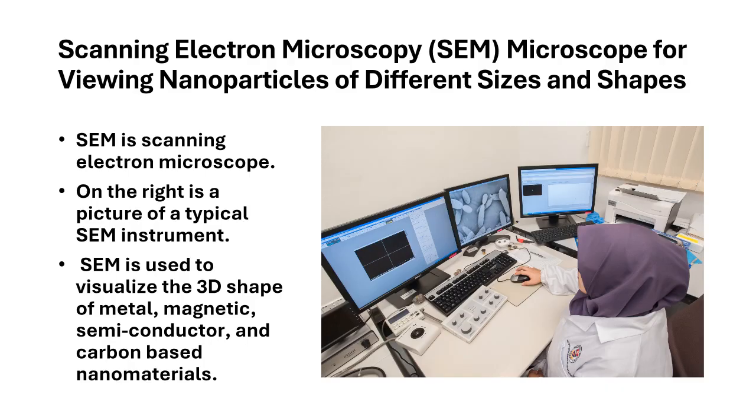Sample preparation for SEM and HRSEM is different than for TEM or HRTEM. For SEM and HRSEM, it is necessary to use a SEM stub and affix a sticky black carbon tape onto the stub. Then the sample needs to be placed on the sticky top side of the black carbon tape. Once that is done, the sample is ready for SEM or HRSEM analysis.